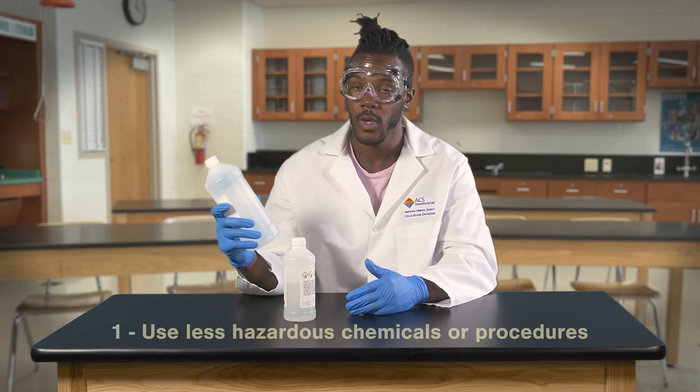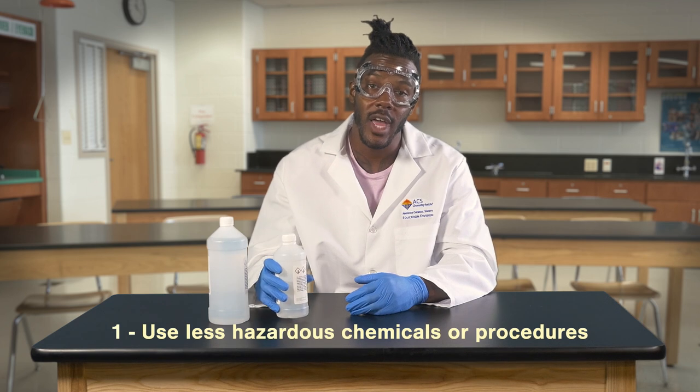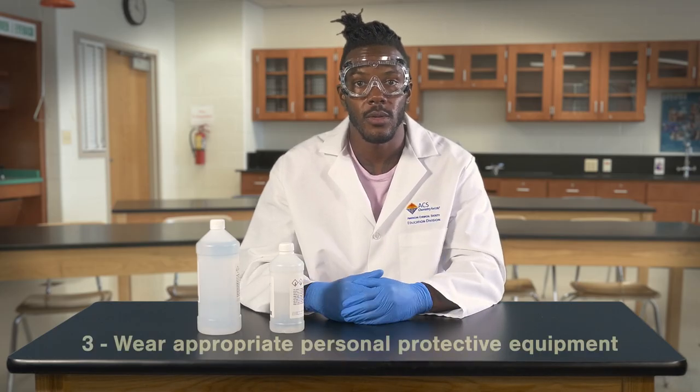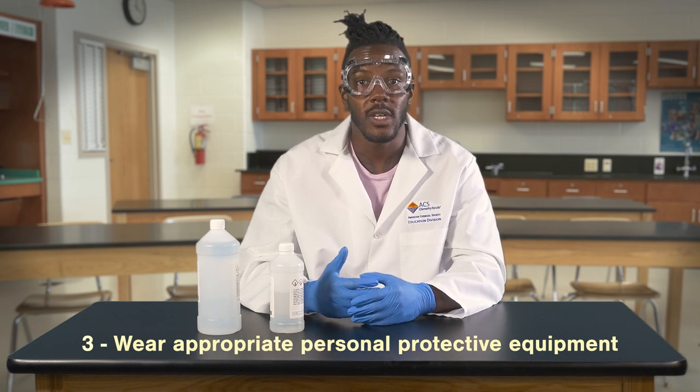One, eliminate the hazard by replacing a particular chemical with a less hazardous one. For example, in the case of hydrochloric acid, your teacher would make sure that you were using the lowest possible concentration of acid to make the experiment work. Two, follow all appropriate safety precautions, which might include working in a fume hood. And three, wear personal protective equipment, such as goggles, aprons, and gloves, to prevent eye and skin contact in case of accidental spills.